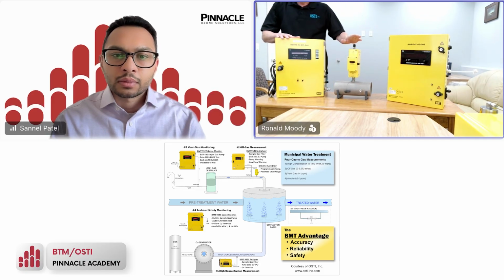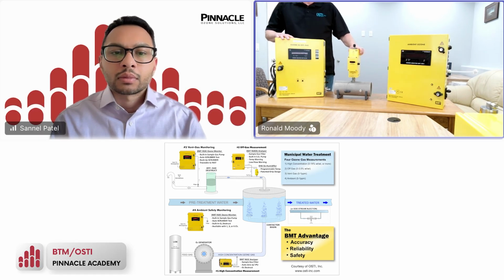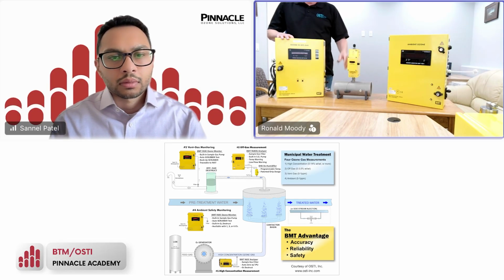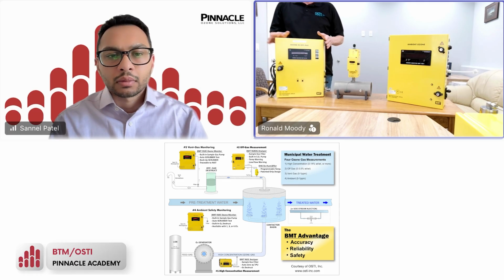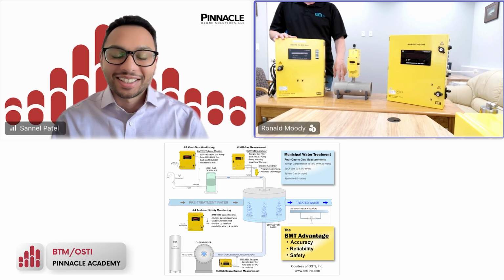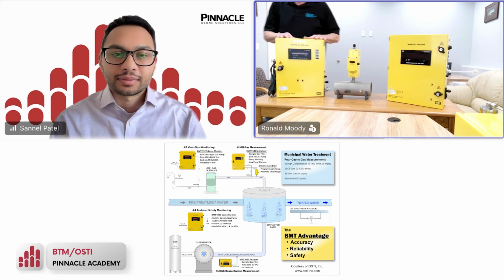And we take that process gas first, since it's humid gas, we take it first through a dehumidifier to condense any humid gas, drop it back into the process line, and cycle the dry gas into the analyzer for measurement, okay? But to normalize the pressure, we then return that back to the off-gas line rather than sending it to a destruct. Okay, that's the second measurement point.